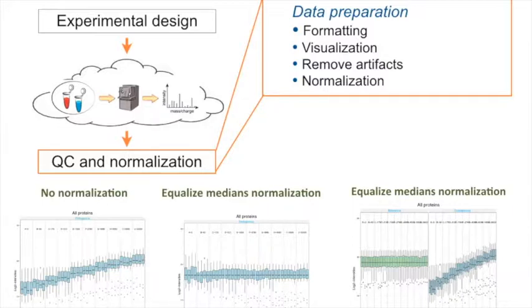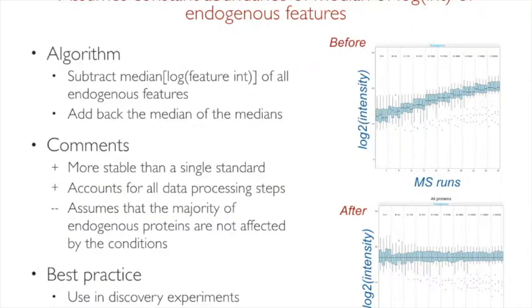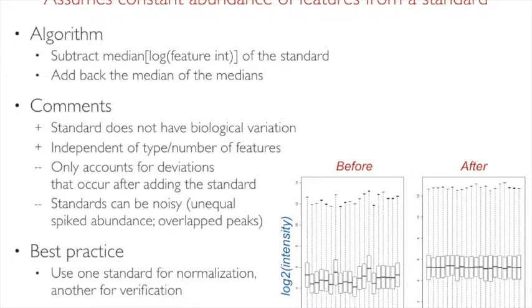So I was kind of trying to summarize it. Maybe I should have put it on the same slide. So for standard-based normalization, you use multiple standards, and it's best used with targeted experiments, right? Or even with large-scale genome-wide experiments, if you can have a reliable standard. So development of the standard is kind of an extra issue here, right?